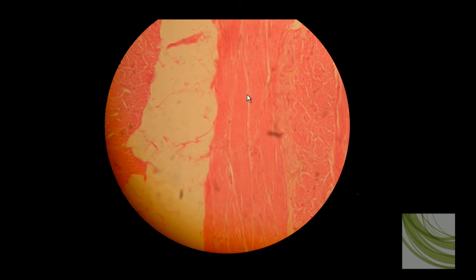Here is the same slide using the 40X objective. I moved it up and down and worked with it, but I just couldn't quite bring out very good striations in this slide. We can still see these longitudinal fibers.